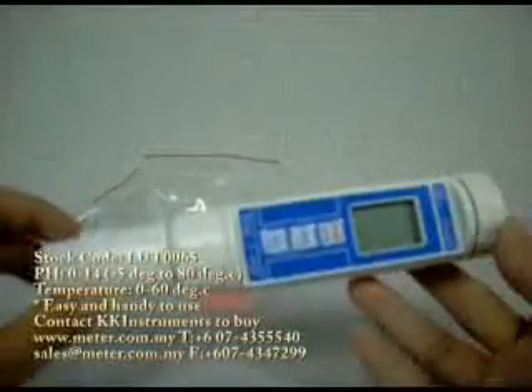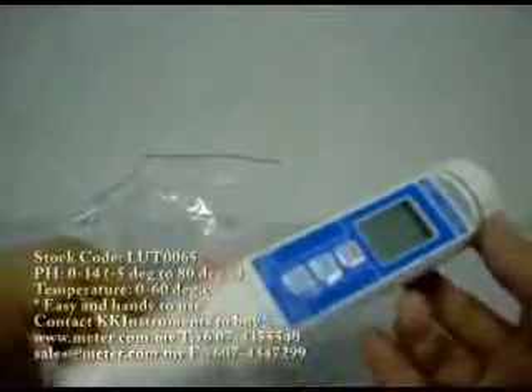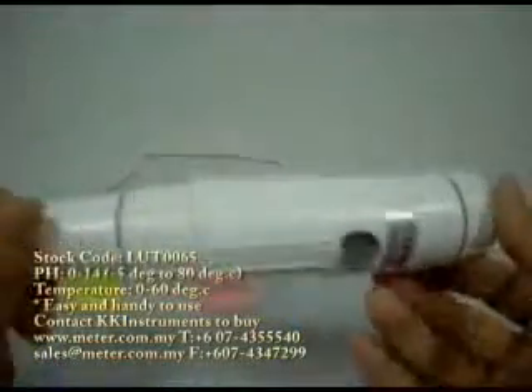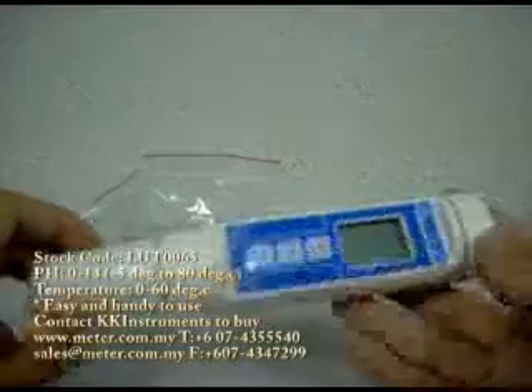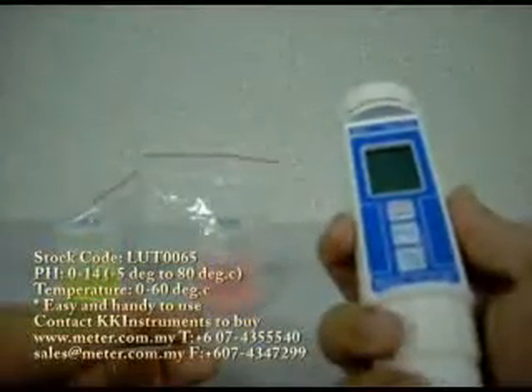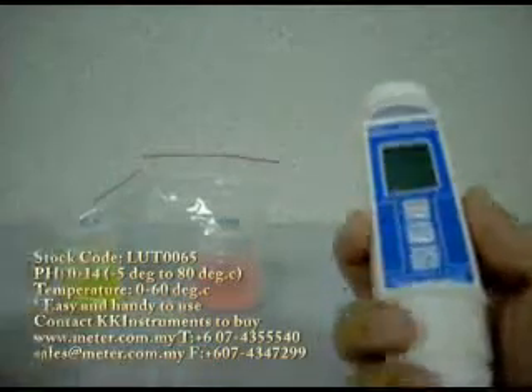Hi. Today I'm going to show you one of our best selling meters. This unit is a handheld pH meter. We call it handheld because you can hold it easily in one hand, and the other hand you can use to record your data.